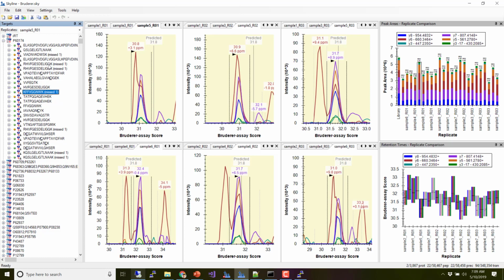That's what we saw with the MS1. I've been showing you some plots where I think I can see, because of the dotp's and some separation, that there's probably some interference going on. And I've said, you have no other choice.